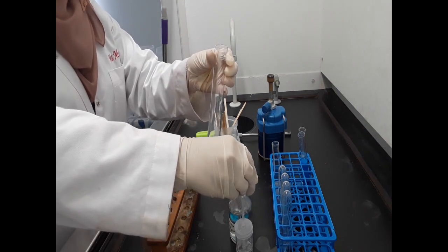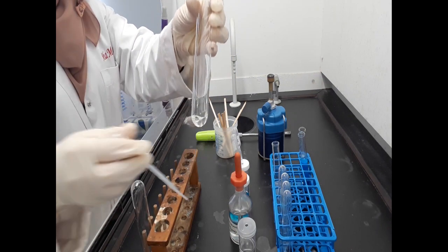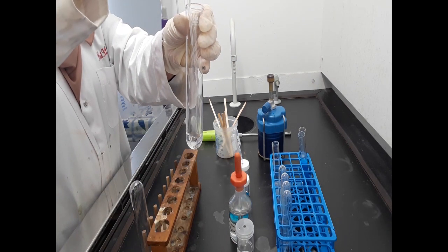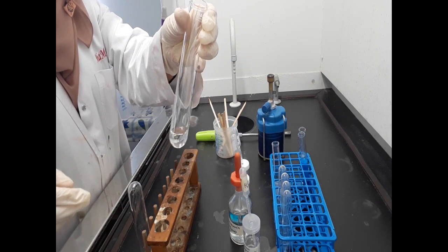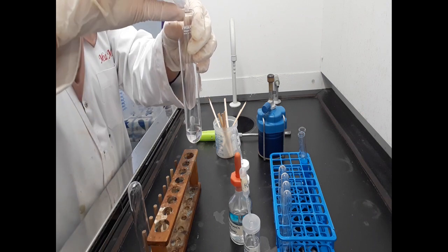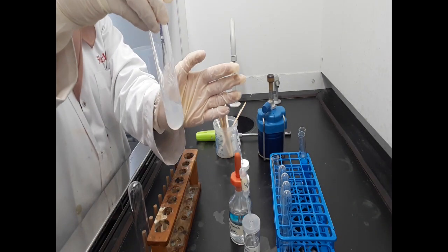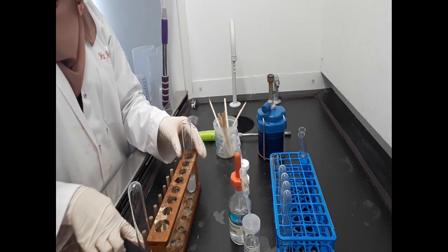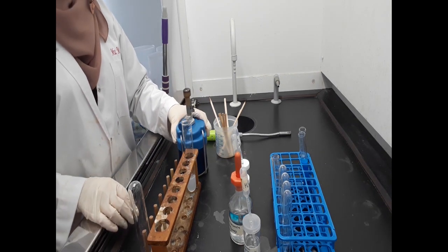To 1 cm depth of aqueous hydrogen peroxide in a boiling tube, add the final mixture from B. So, 1 cm of aqueous hydrogen peroxide, and then we add the final mixture from B. Hydrogen peroxide is a test for oxygen, so we need to warm this gently.